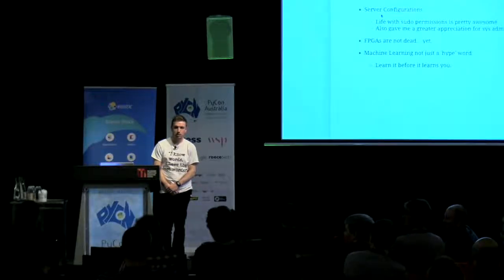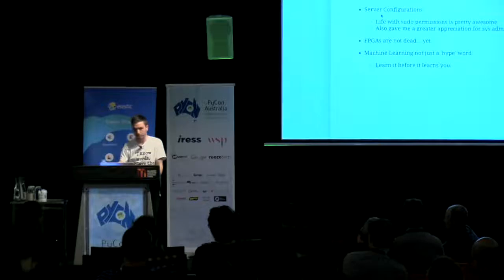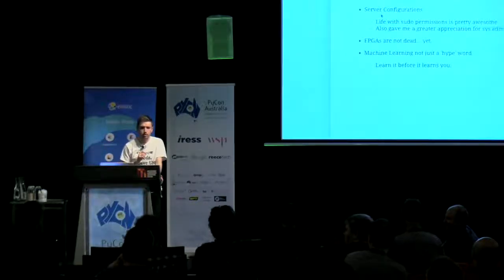So you described a little bit about the Nanopore MinION thing. That algorithm that does the converting to the base pairs, that's only the first stage.